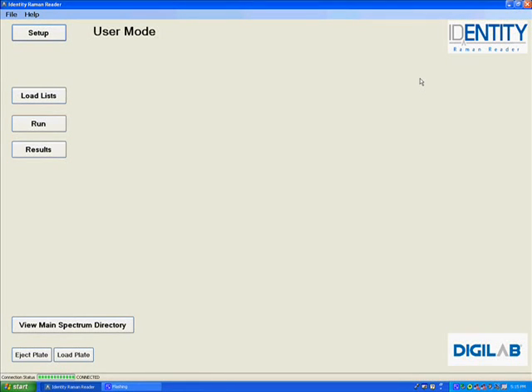The Identity software is an intuitive, easy-to-use software package which is designed to work as any other plate reader software that's on the market.